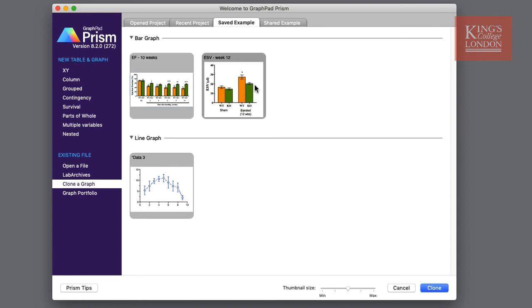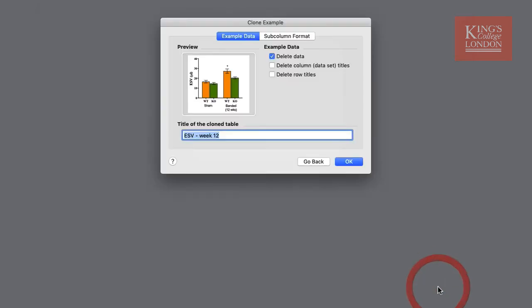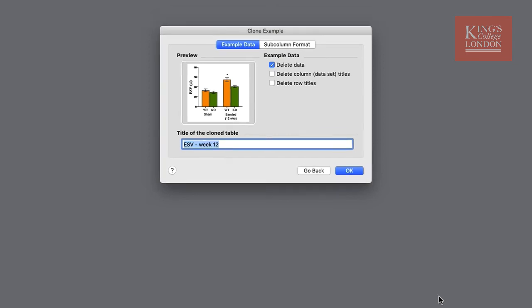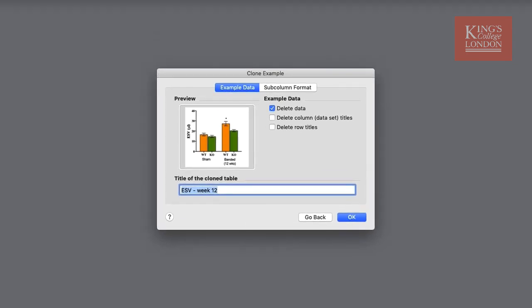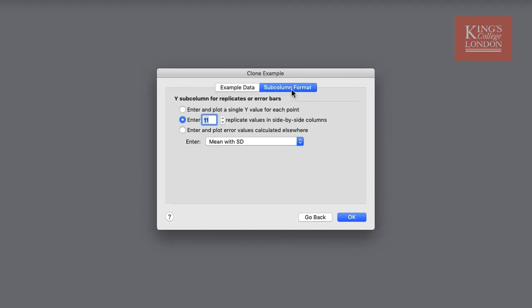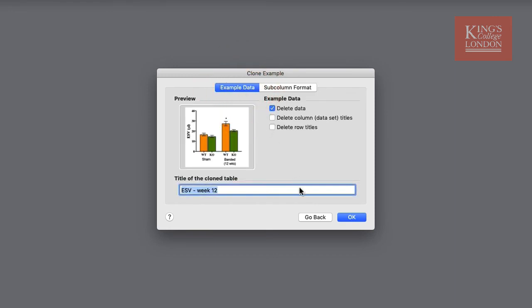When selecting one of these graphs and pressing clone Prism will give you the option whether you want to delete the data, delete the column data and delete titles, change the name of the graph and also change the sub column format information such as n numbers. But we're going to go back to the welcome page.